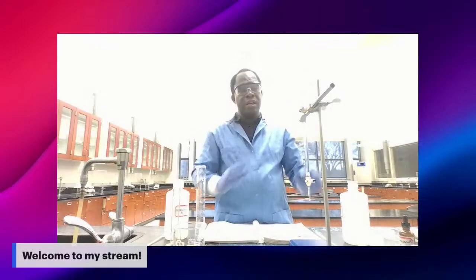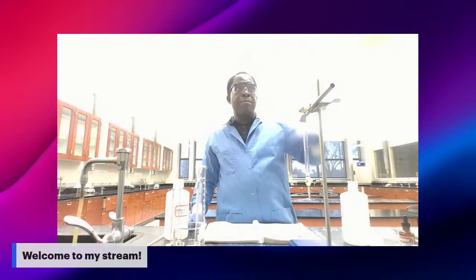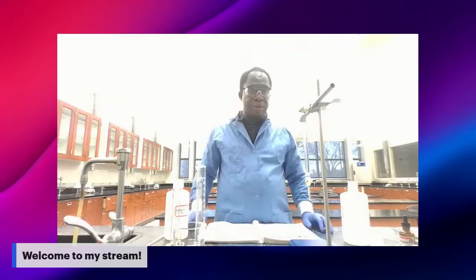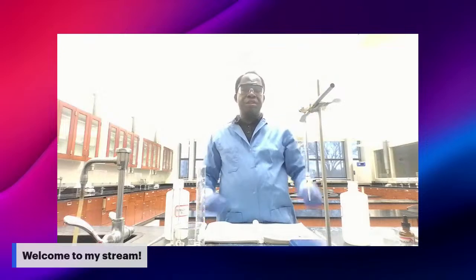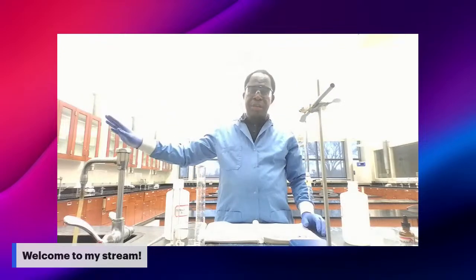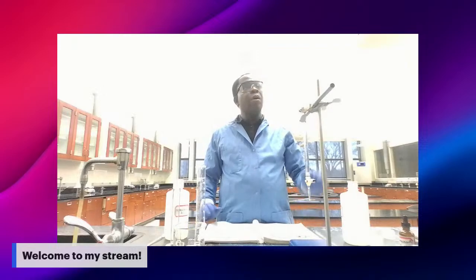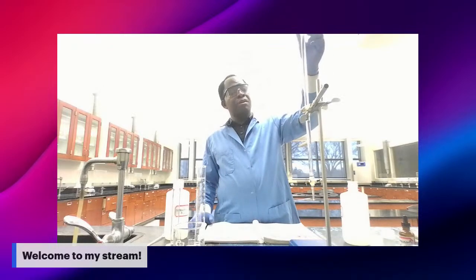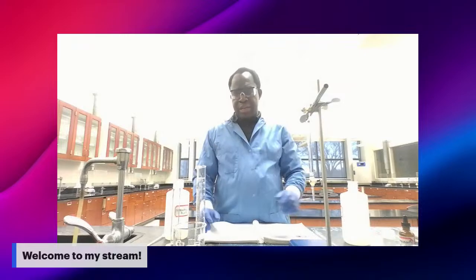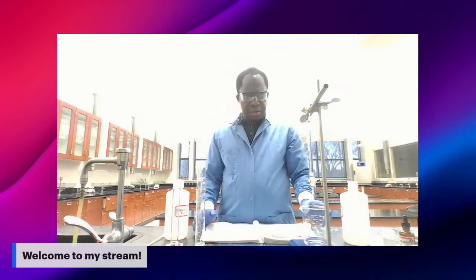This is how you make sure your burette is clean. Then you fill it back up with new NaOH. The NaOH you cleaned the burette with, you need to dump in the liquid waste. Now I have my burette filled with NaOH and ready for the titration part.